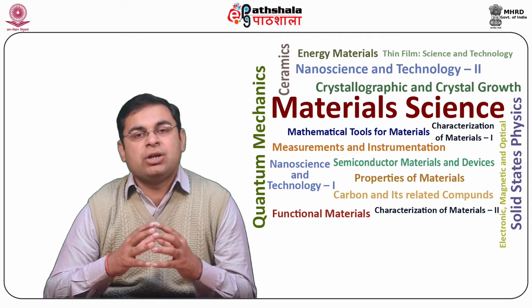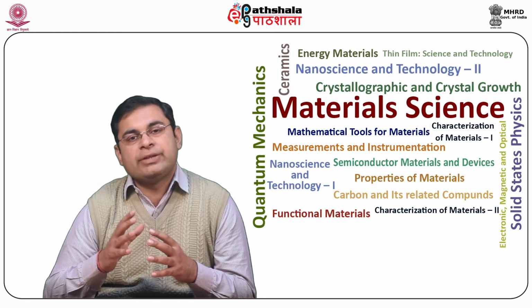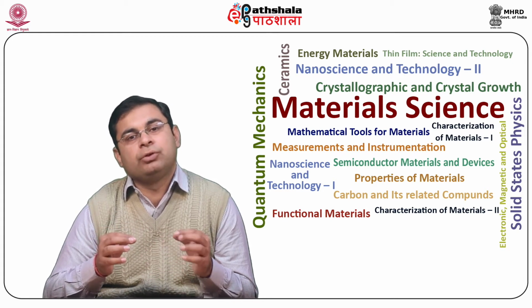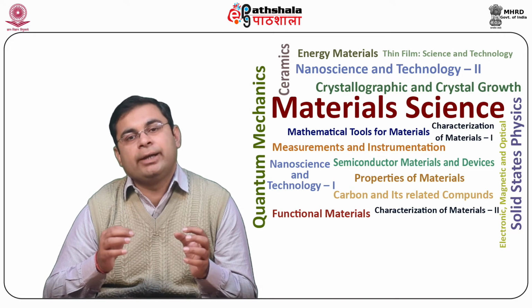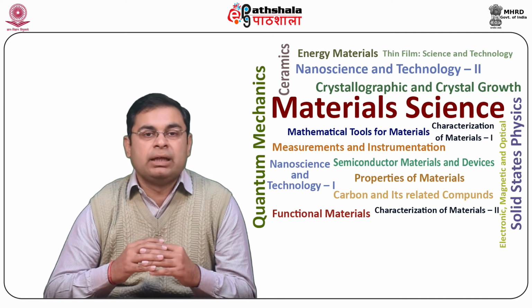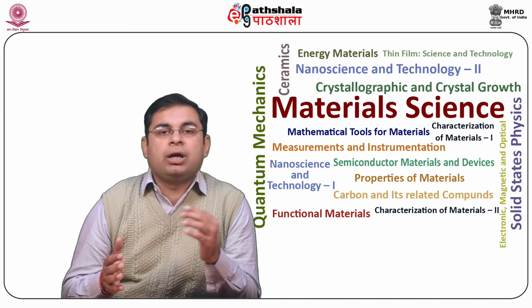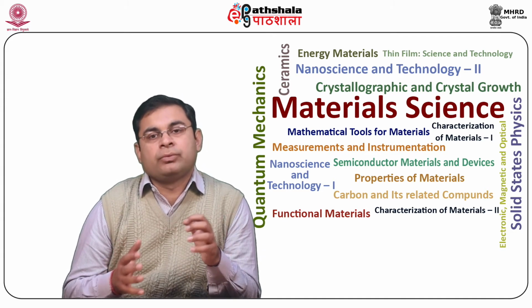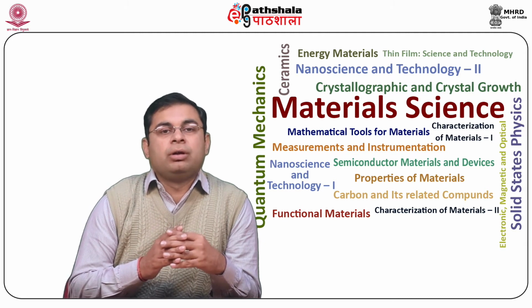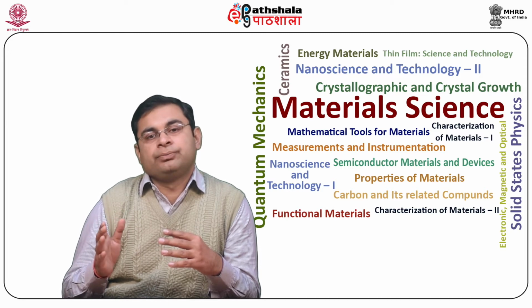The excess energy of the electron is removed via, first, X-ray emission. This phenomenon forms the basis of X-ray fluorescence, that is XRF, and electron probe microanalysis, EMP. Second, emitting another electron from the atom. These electrons are termed Auger electrons, after Pierre Auger, the discoverer of this process in the 1920s.